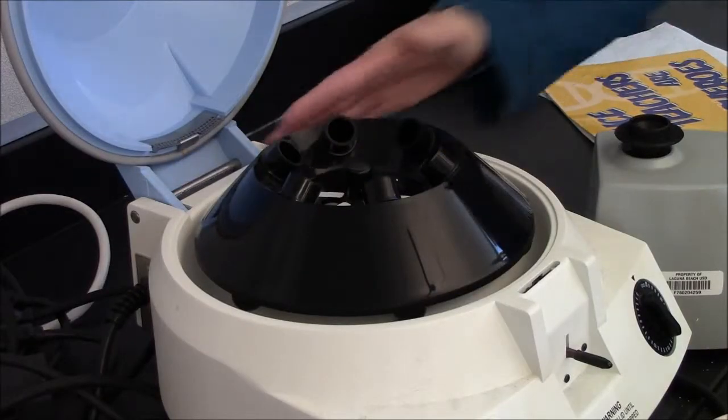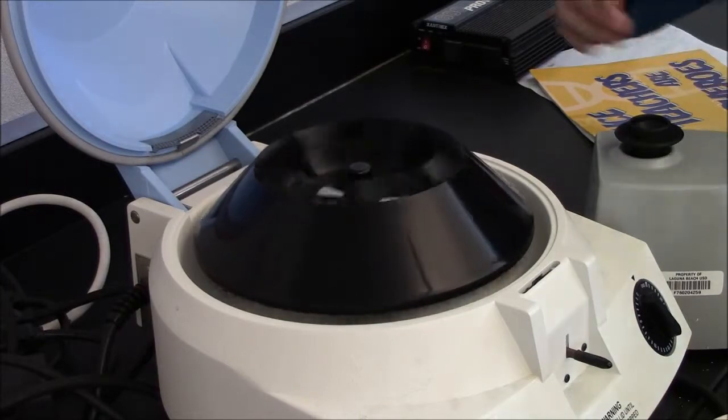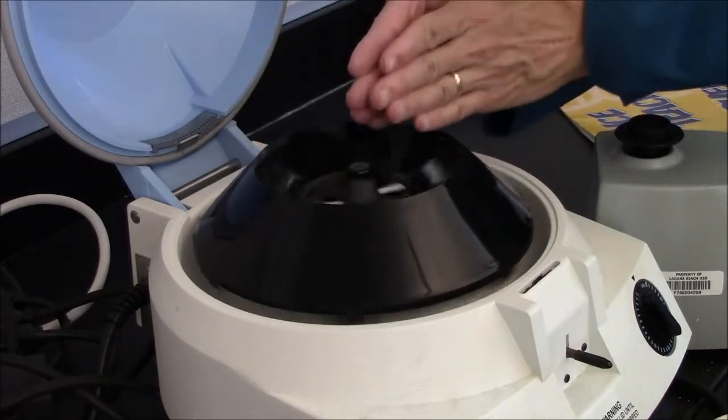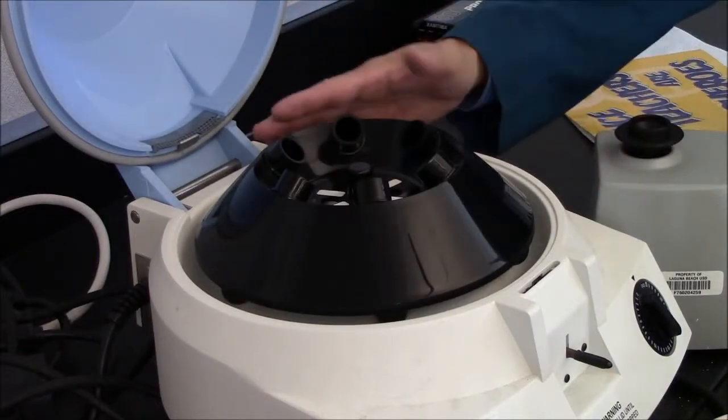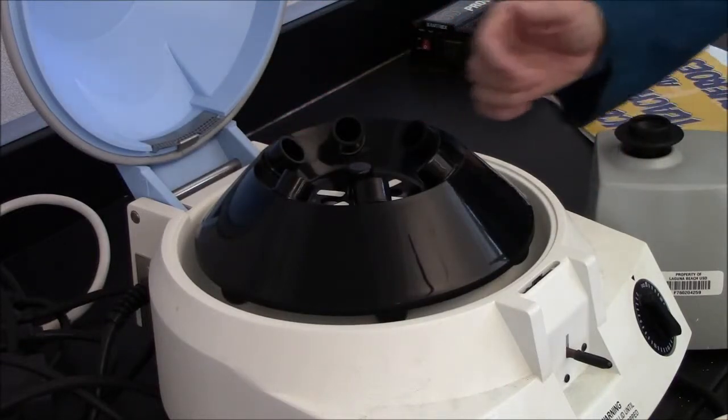The centrifuge will spin at about 3,000 RPMs. As it does so, it's creating a centrifugal force pushing material away from the center. This is what allows it to separate materials.